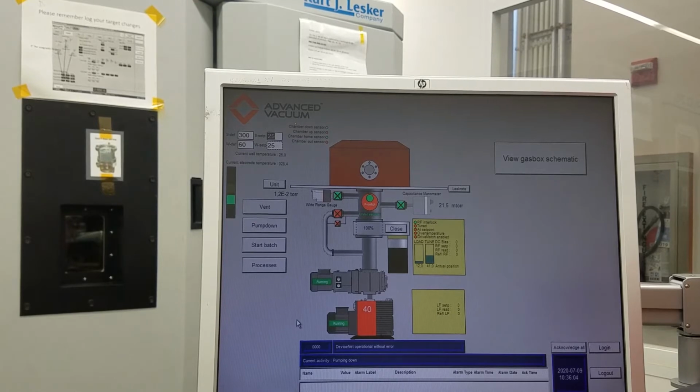When you open the chamber, you probably can see the flakes coming off the wall, and you will see the flakes sitting on the substrate holder and everywhere. That's a disaster situation. We will try everything to avoid that. But if you open the chamber and see that it is a disaster, then stop. Don't do anything. Call or email the staff. We will clean the chamber before you can do anything, okay?